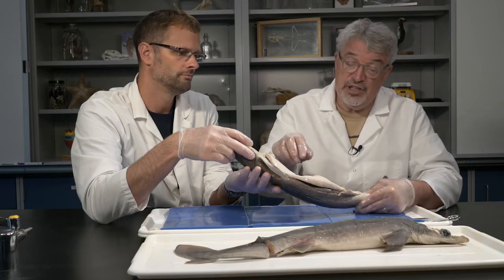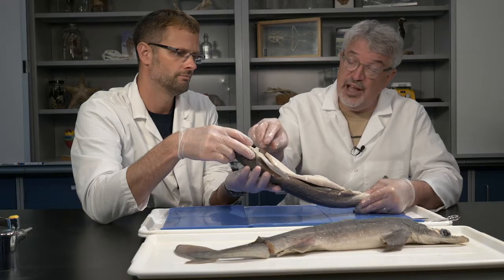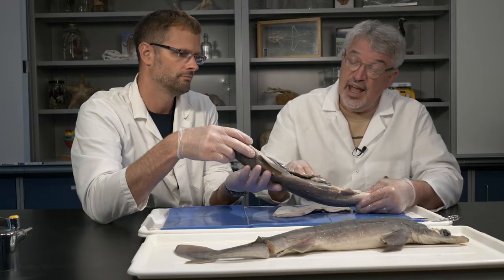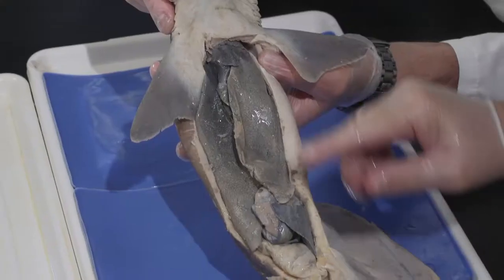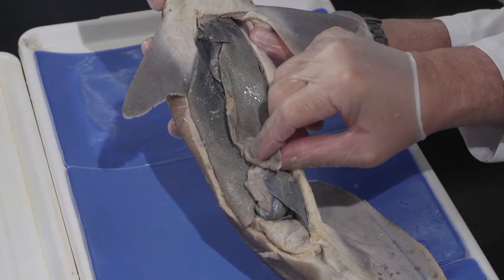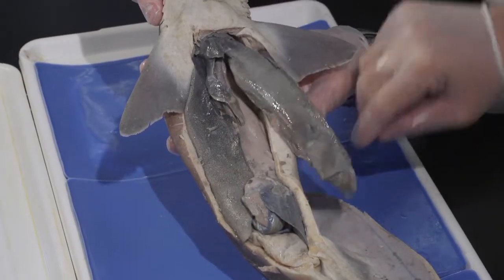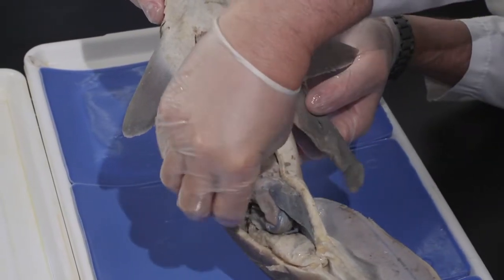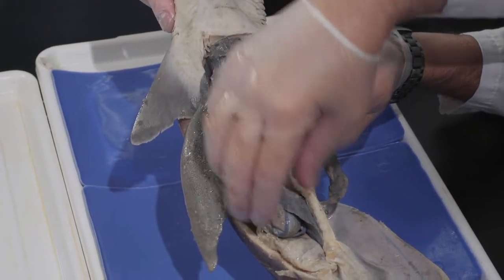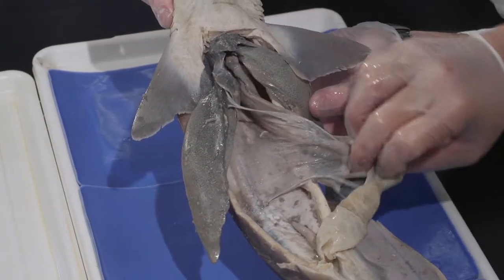The differences internally are fairly minimal. As we've previously dissected this animal, you can see the internal structure is pretty much the same as the female we looked at. You have this very large liver with three lobes, then the stomach, small intestine, and spleen here.